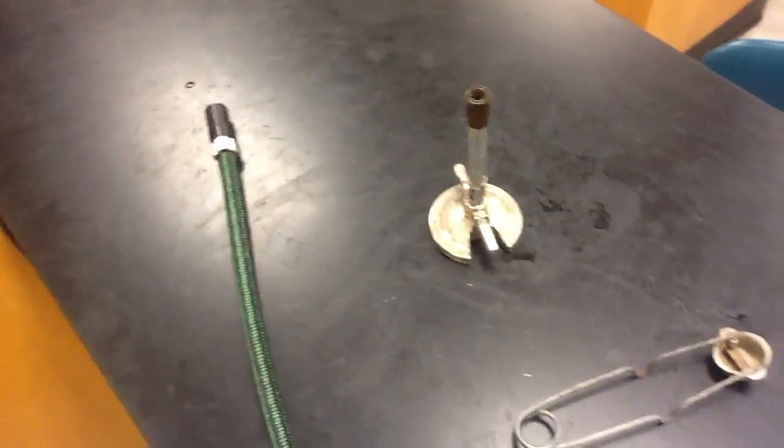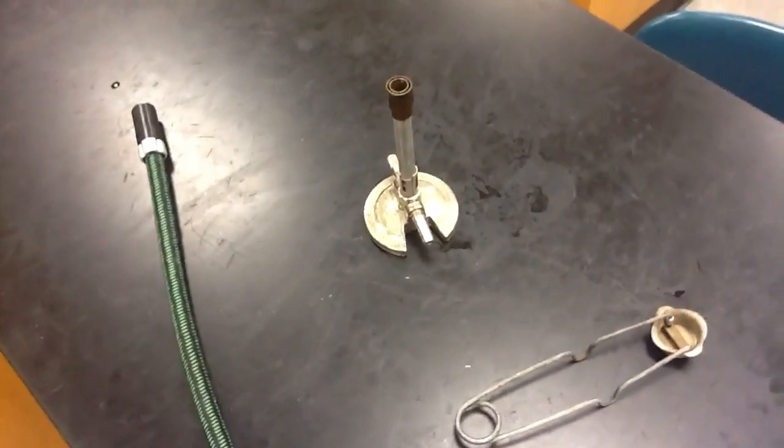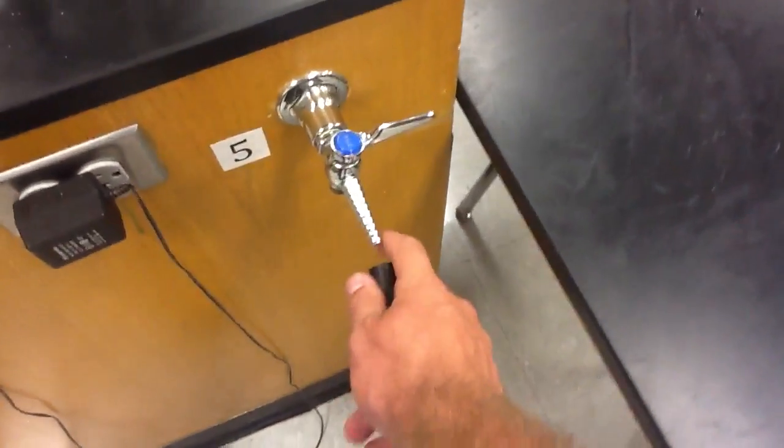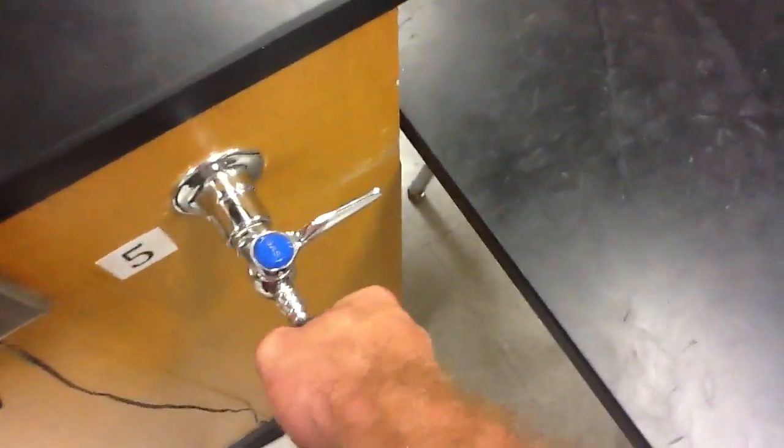Alright, next thing you need to do is connect the Bunsen burner so it can be lit. You're going to want to take off this tennis ball - don't throw it though. Connect the hose to the valve and the other end to the burner.